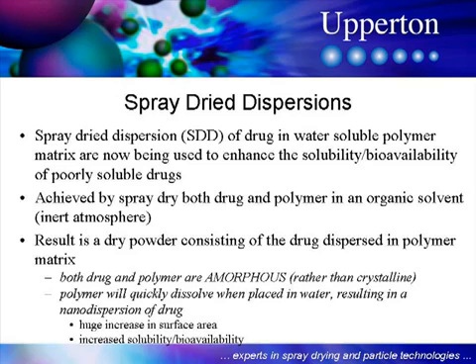Spray dried dispersions, or SDDs, are now being used to enhance the solubility and bioavailability of poorly soluble drugs. This is achieved by spray drying both the drug and the polymer from an organic solvent, and this is usually done in an inert atmosphere to avoid the risk of flammability and explosion.